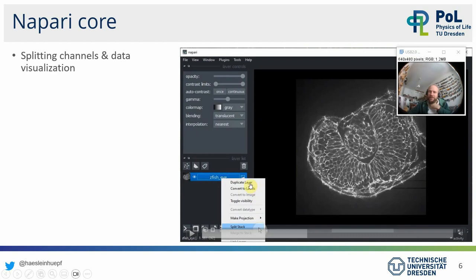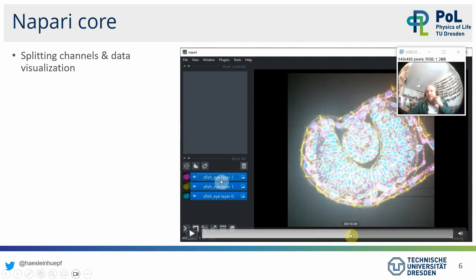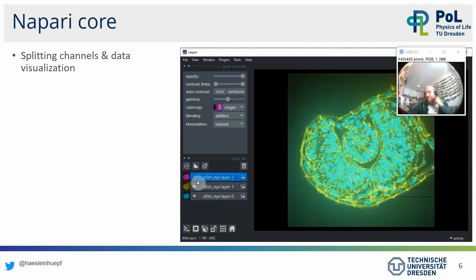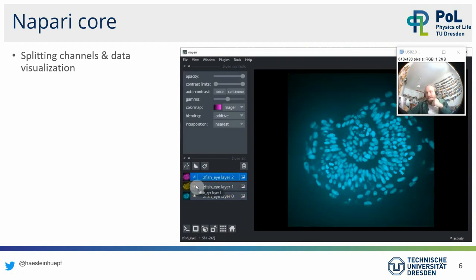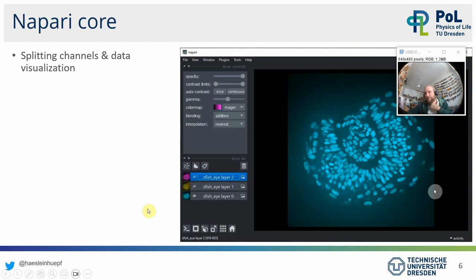In this case, I loaded a dataset which has three channels, but Napari loaded it as three slices. So you can split this stack into three individual channels and then modify how they are visualized independently. That's a common thing people need to do after opening their data — bringing it into a shape so that Napari understands properly what kind of data it is supposed to be.